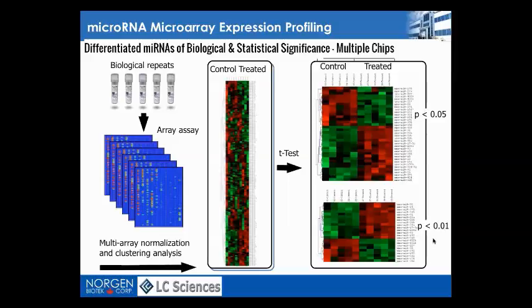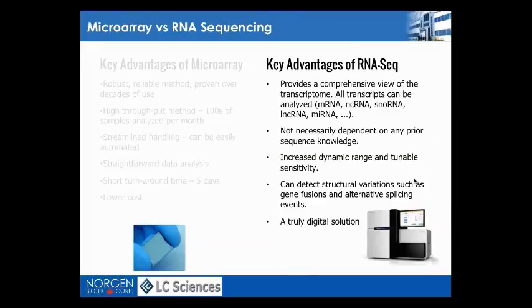significance of the results, and from there on you go on to look at the potential targets, pathway analysis, etc.